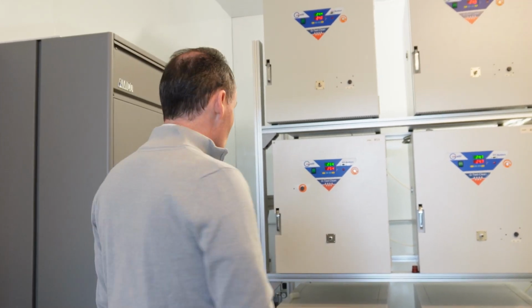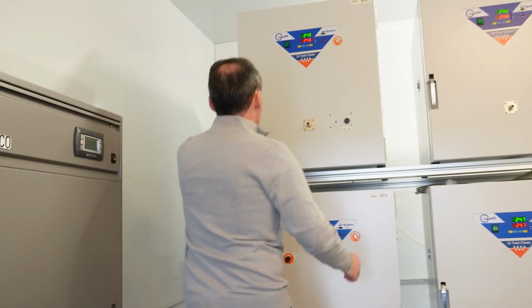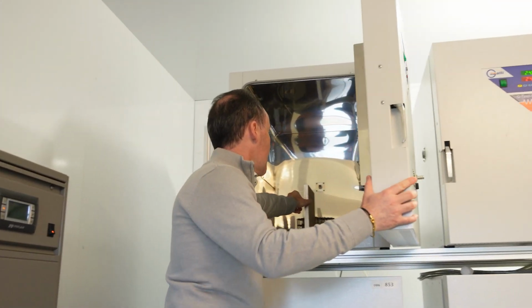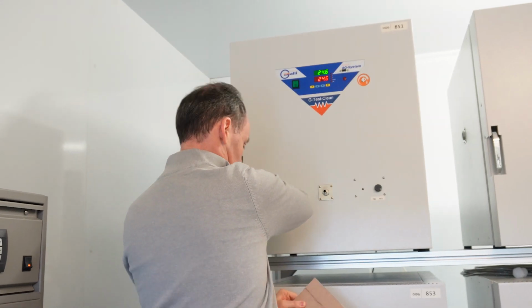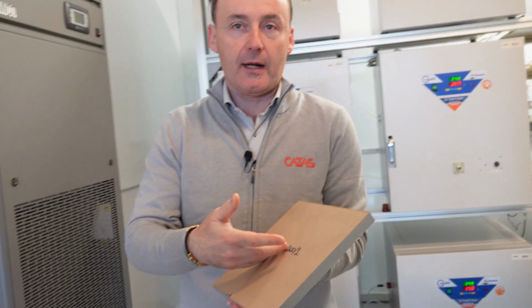We have just completed a test. Let me show you the sample that we tested in this chamber. It's a small board sample, MDF board. We have labeled it with all the traceability information and details for the client. The test has been successfully completed and the sample is compliant. We can remove it from the test room and store it.